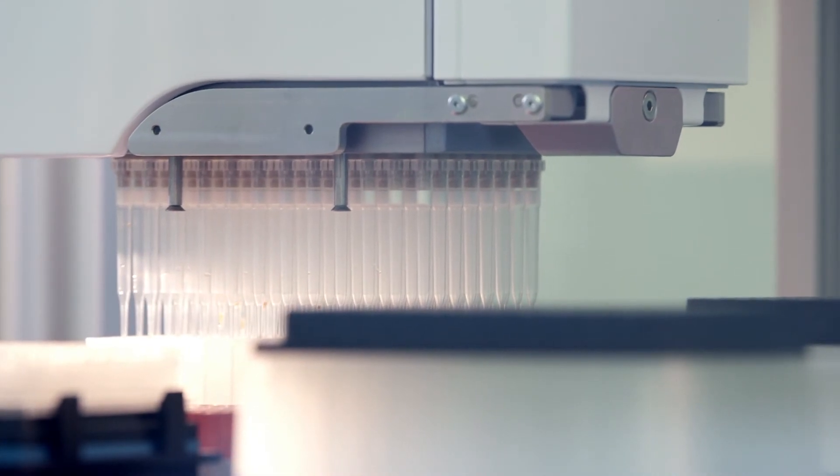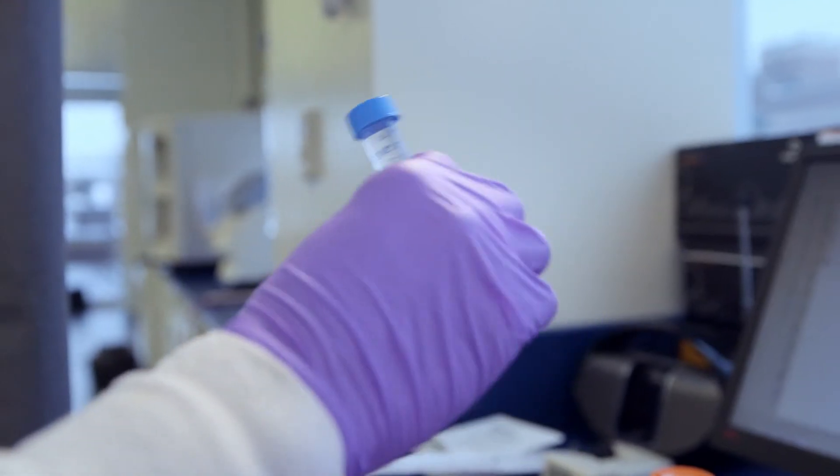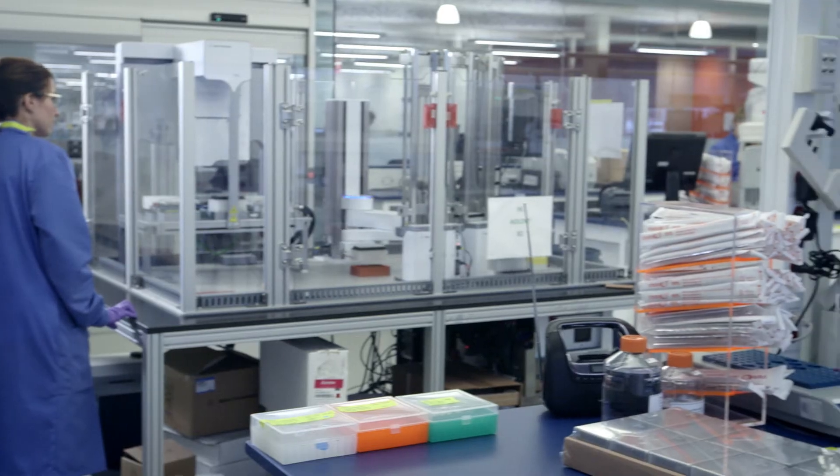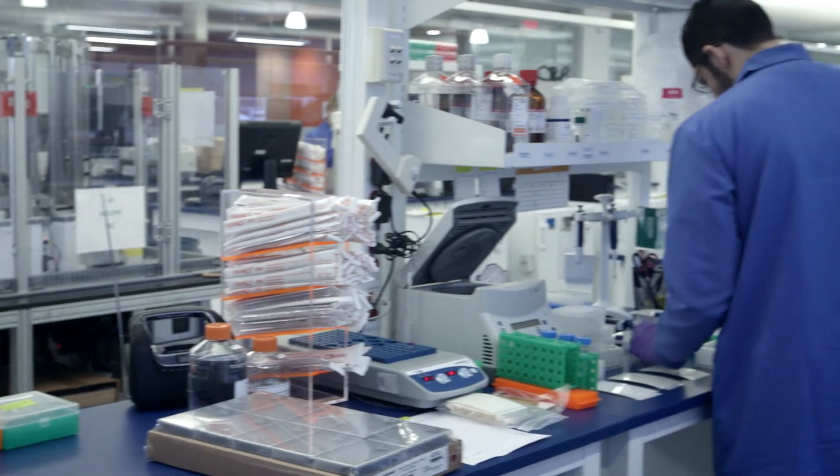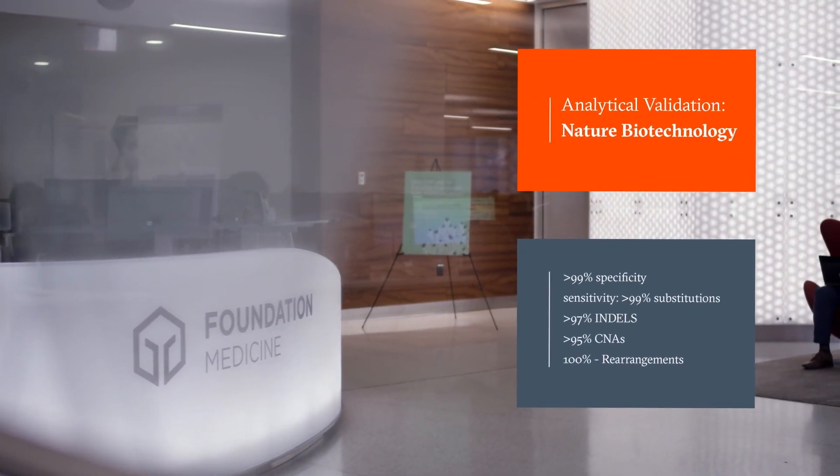The process differs from traditional hotspot tests, which use PCR amplicons to target specific regions of the genome. This library construction and hybrid capture enables Foundation One to achieve high specificity and sensitivity.